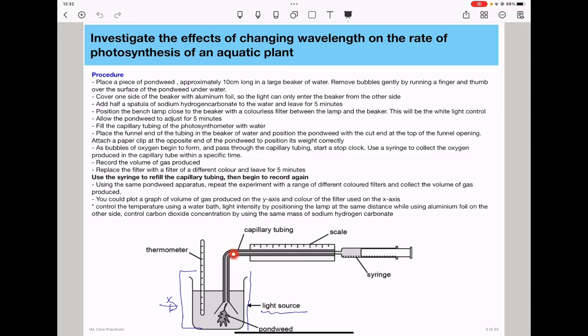Water has to be filled in here so that as the oxygen is produced, it comes into the capillary tubing and there will be some displacement of the water. Then place the funnel end of the tubing in a beaker of water and position the pondweed with a cut end at the top of the funnel opening. This will ensure that all the oxygen produced at this point comes directly into the capillary tubing so that we do not lose any volume of gas, and that means our experiment is going to give us better results.